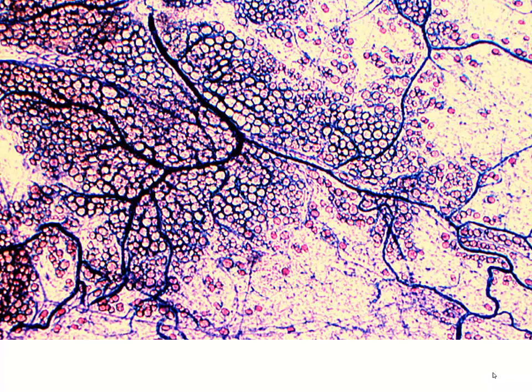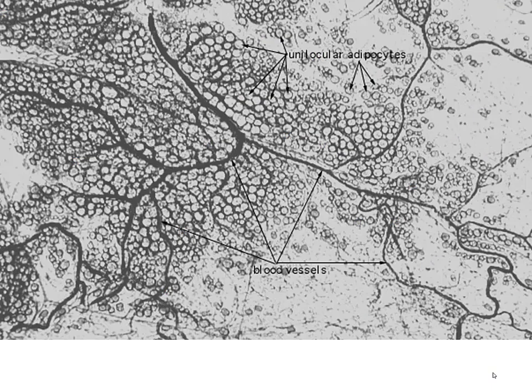Much of what we see in these circular structures are going to be adipocytes. You find a lot of tissue associated with mesentery. Now, this is not a magnification that I would expect you to visualize adipocytes, but as we go through and see these, you will certainly be able to suspect, even at this magnification, we are looking at fat cells.